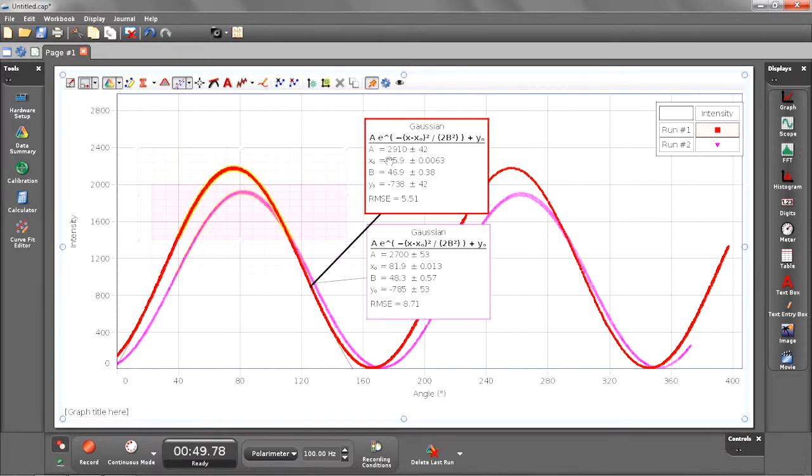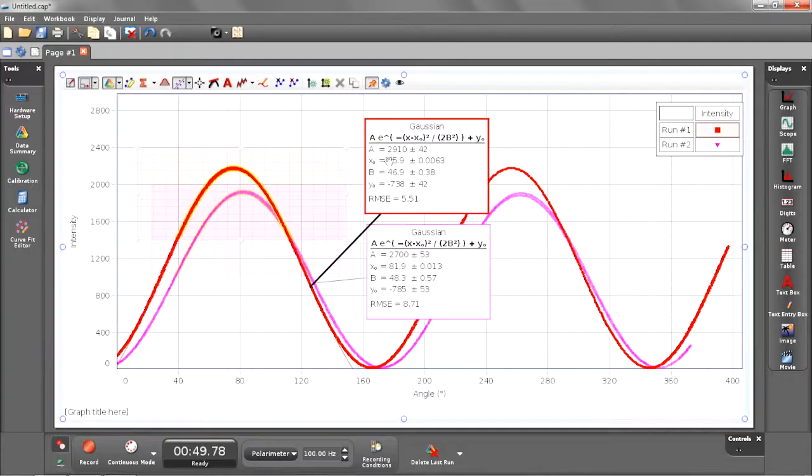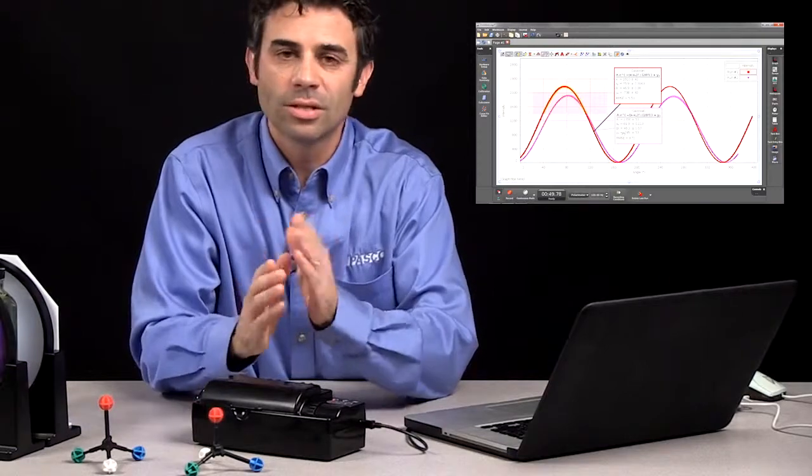And now I have my Gaussian fit for both of those samples. So my blank water, the sort of zeroing or blanking based on the water was at 75.9 degrees. And the rotation for the sample of sugar was at 81.9 degrees. So it looks like based on the concentration of sugar in there, I had a 6 degree rotation.